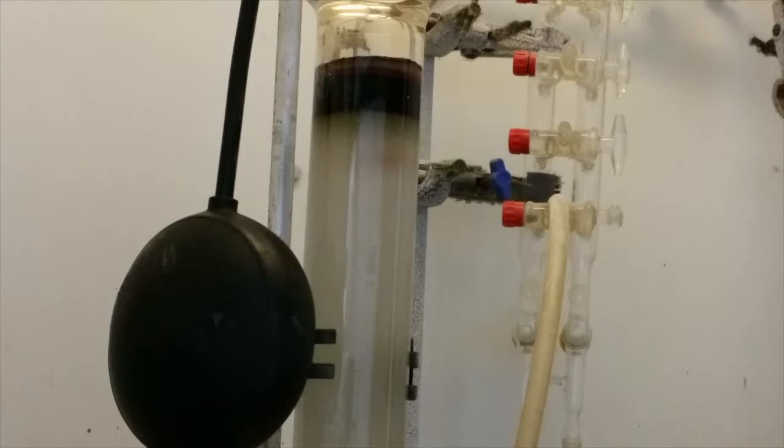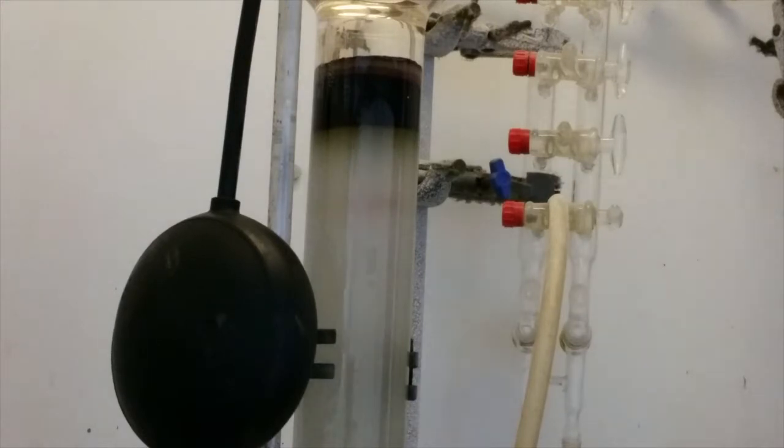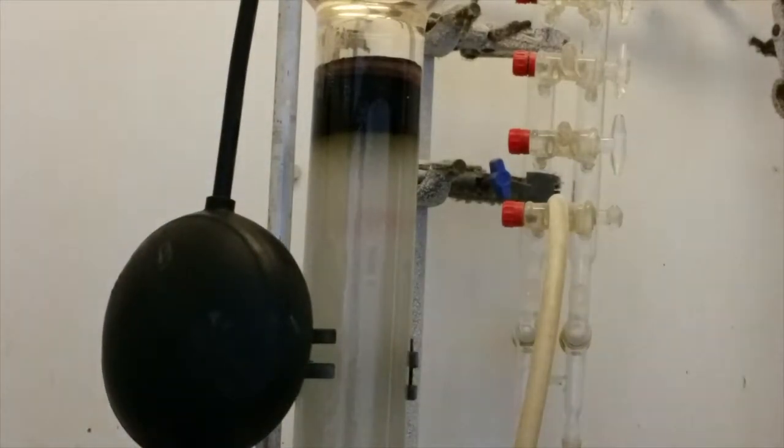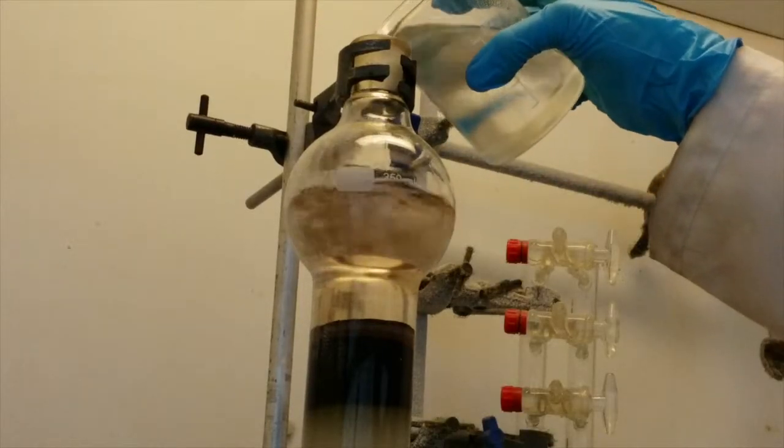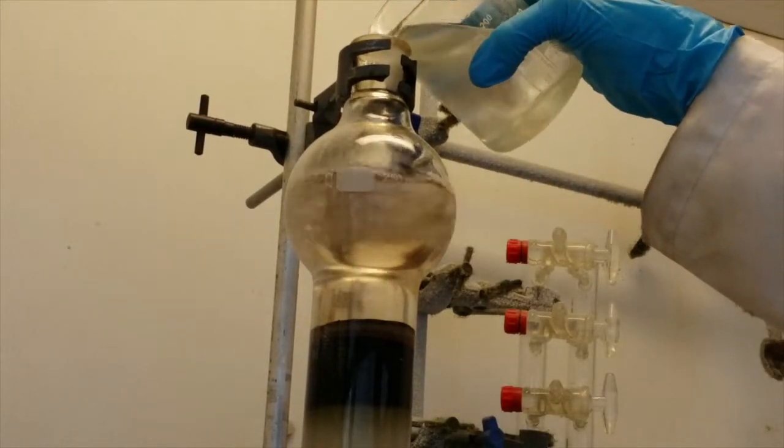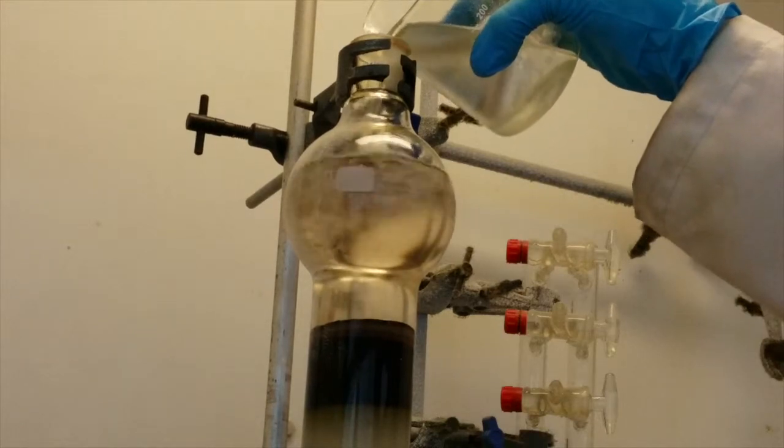Over time the product will move down the column hopefully separating into one or more bands. You can ascertain which is the product which you would like to collect by comparing this to a TLC you have run of the product earlier. During the column continue to keep your reservoir filled with solvent and do not allow your silica to dry out at any time.